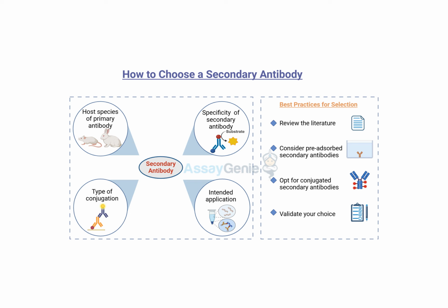Oh, yeah, absolutely. The specific ones will depend on the technique. But for instance, in Western blots, it's common to use a loading control. That helps make sure you've loaded equal amounts of protein in each lane of your gel. So any differences you see are really due to your target protein levels. So you're really controlling for the amount of sample to make sure you're comparing things fairly. That makes a lot of sense. It's all about having those safeguards in place to make sure your findings are solid.